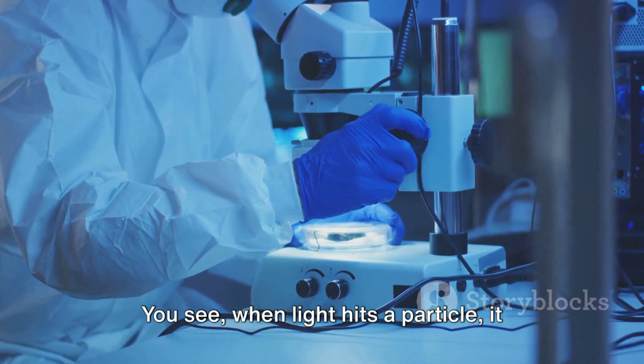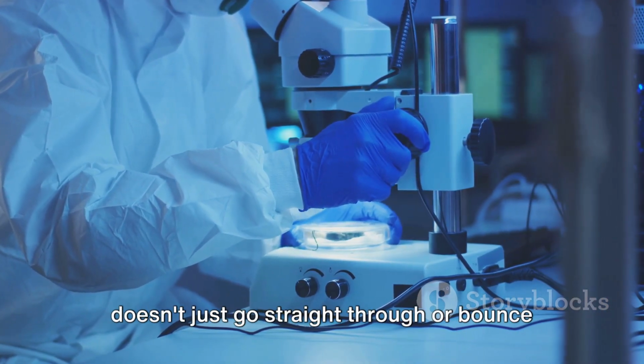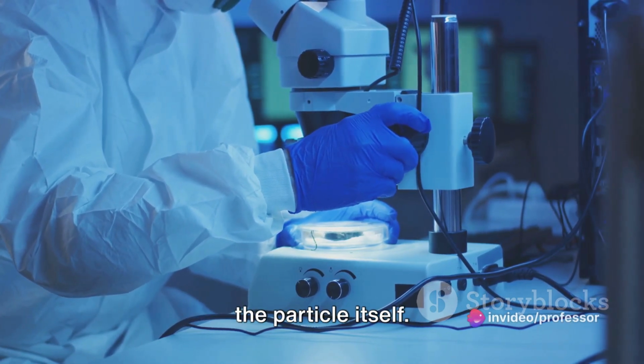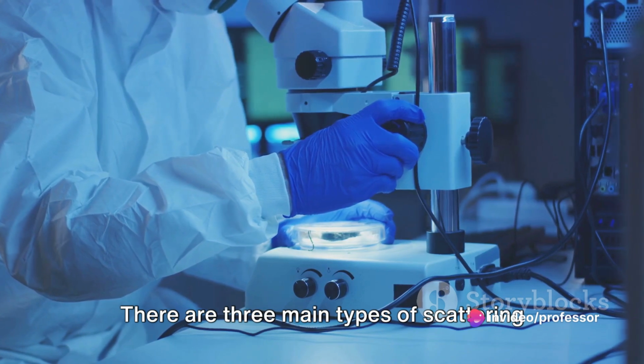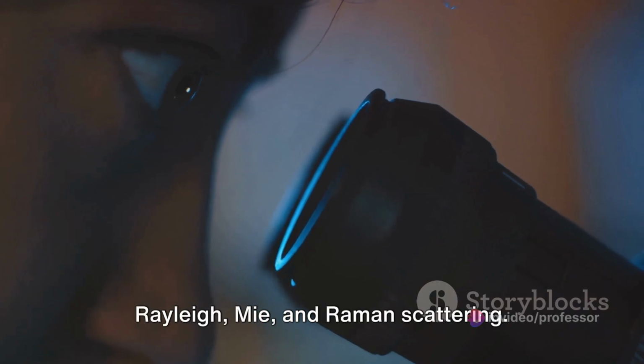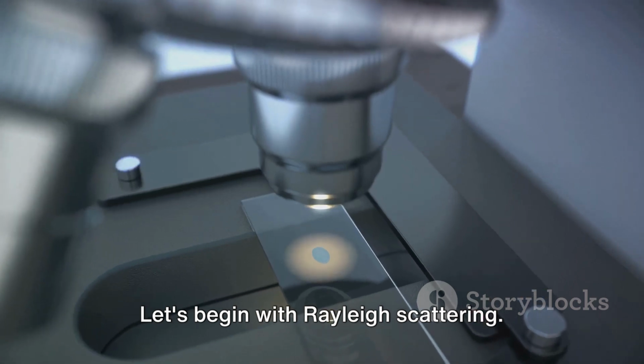You see, when light hits a particle, it doesn't just go straight through or bounce back, it scatters. This scattering can tell us a lot about the particle itself. There are three main types of scattering that we consider in spectroscopy: Rayleigh, Mie, and Raman scattering. Let's begin with Rayleigh scattering.